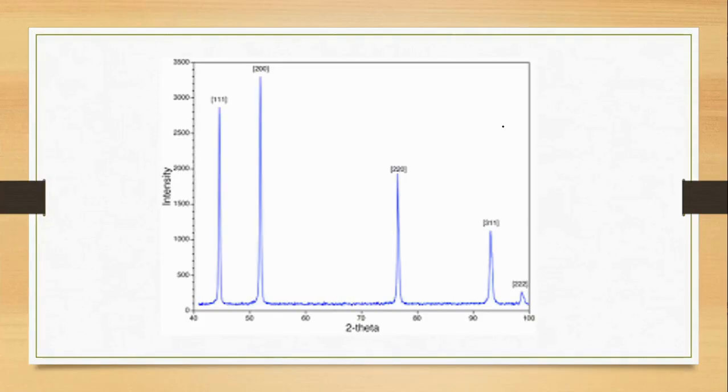Can you maybe expand on what sort of properties you're looking for? Okay, sure. So what I'm looking into is, for example, let's say lattice strain. I want to look into if there's any strain in the bonds or not, or if there's any change in the lattice parameters. Or I might look into texture, if that's possible, or any kind of other defects besides the obvious crystal structure.